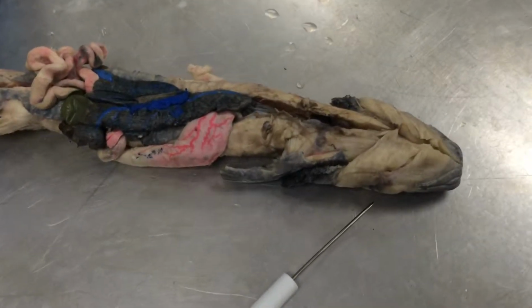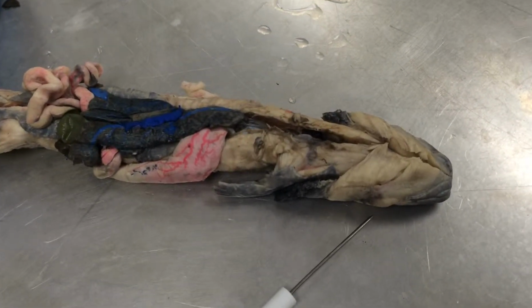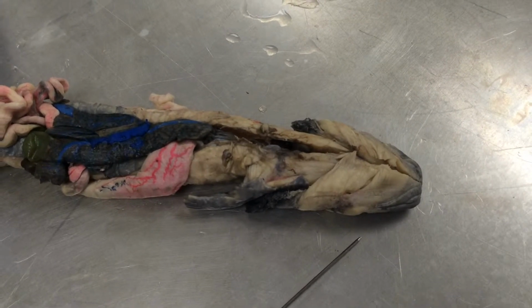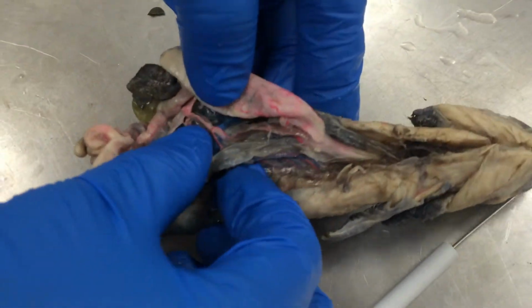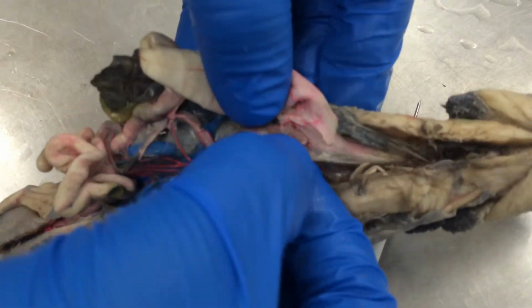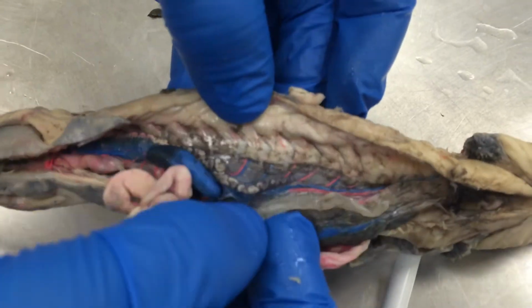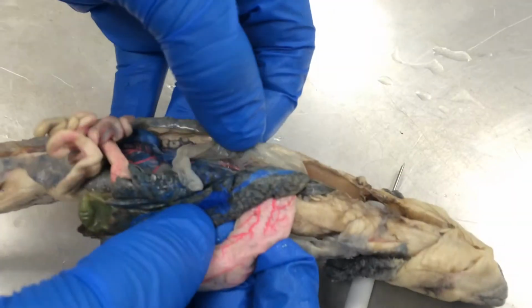In this video, we will be discussing the Necturus respiratory system. In the Necturus, lungs are present, but they are minimally functional. So you see the lungs are both on the right and left side. They're like clear bag looking, small, very thin, which is something that we didn't see in the dogfish shark.